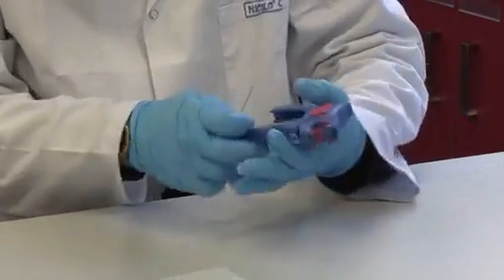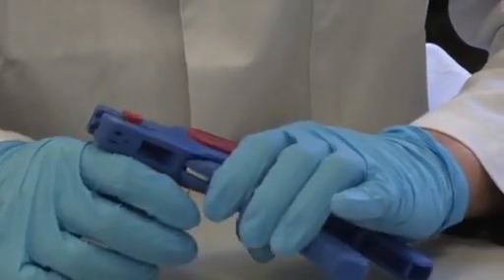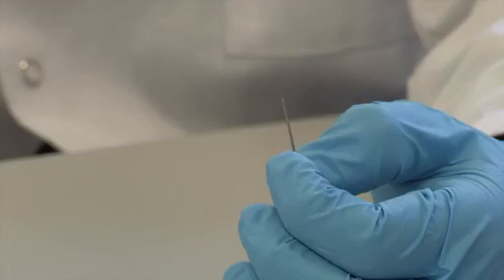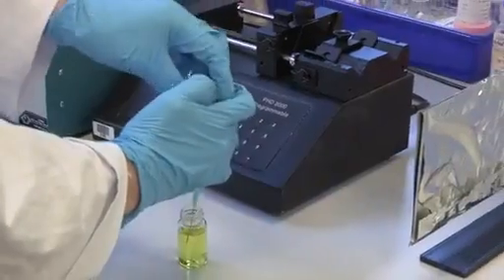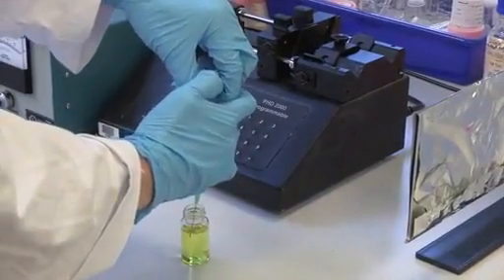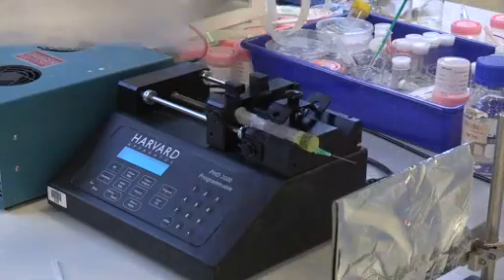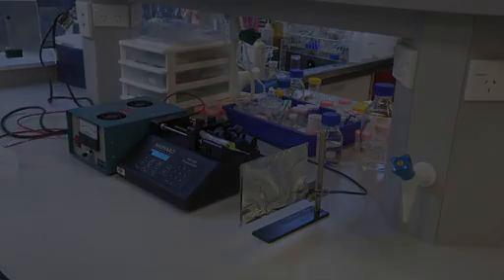To prepare the needle used for the electrospinning process, cut the tip of a 21 gauge needle and sand it down using moderate grade sandpaper until the tip is completely flat. Load the precursor solution into the syringe and place it on the syringe pump. Wrap the collector plate with aluminium foil and place the protective shield around the setup.